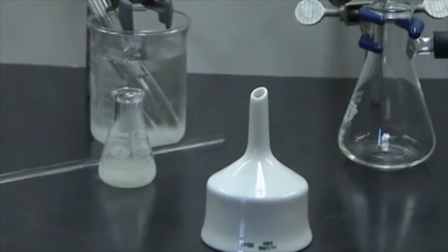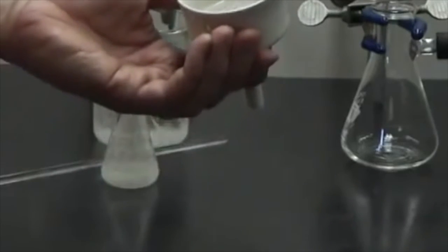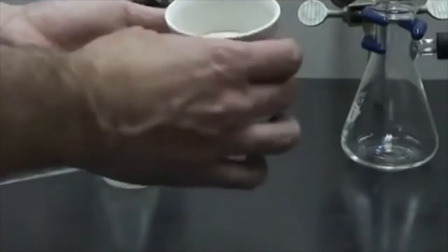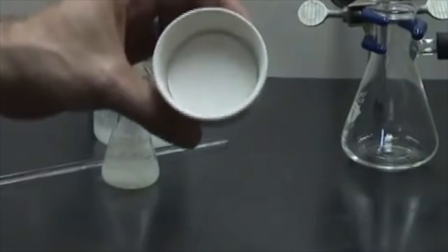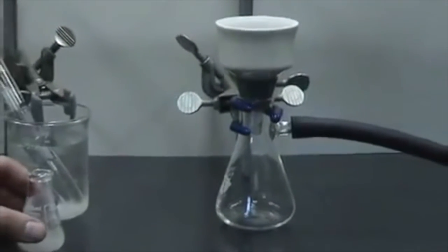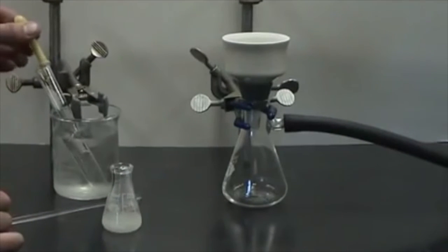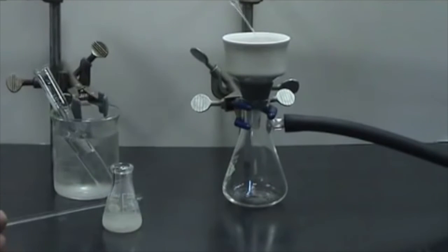To do this, we'll need a Buchner funnel, a filter flask which we have clamped to the ring stand and attached to the aspirator at the workbench, some cold recrystallizing solvent, which we have chilled in the ice bath, and a stirring rod. As you just saw, we also need to fit the Buchner funnel with the neoprene adapter and then add the correct size filter paper. Turn on the vacuum source and then wet the paper with the recrystallizing solvent.